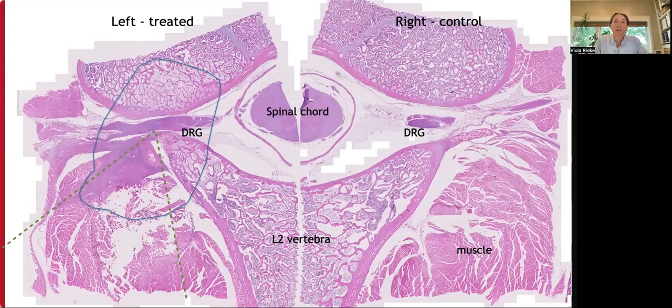Histology processing appears to be more an art than a science, and we did not get good histological sections in all animals. The left and right side were processed in separate cassettes, so the slides don't line up perfectly.